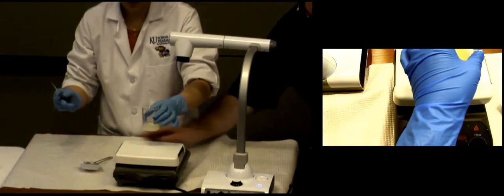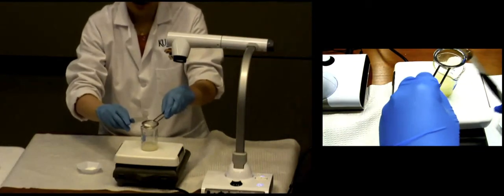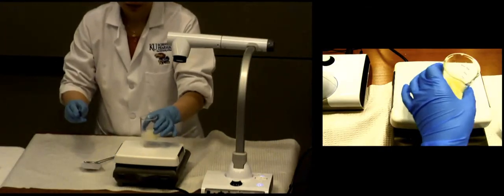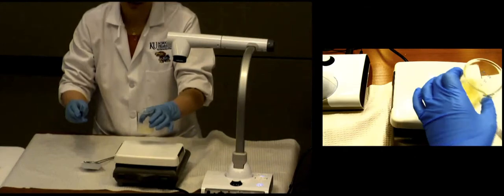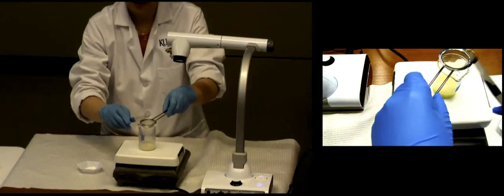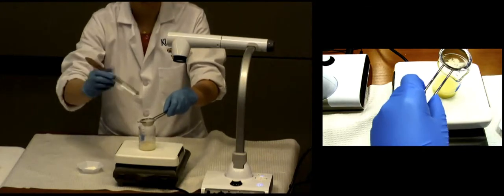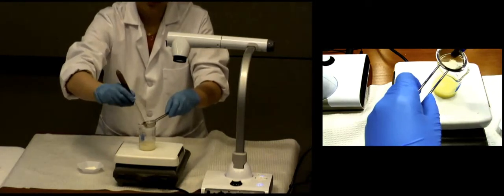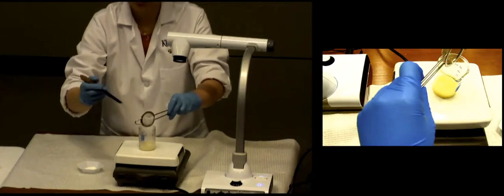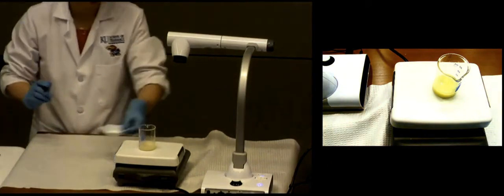We've turned off the heat. All you need to do now is just lift up and then shake a little bit so the powder can come off. And keep sifting in there. Again, you want to do it a little slower than I do here probably, because I do see a little bit of powder chunk formed on the top there. Alright, and even though we triturated, there are little powder particles formed on the very bottom, and you can use your metal spatula to try to sieve them to the bottom. If there's still some, you can just toss all of them in at the end. Remember that we collect in the weigh boat.